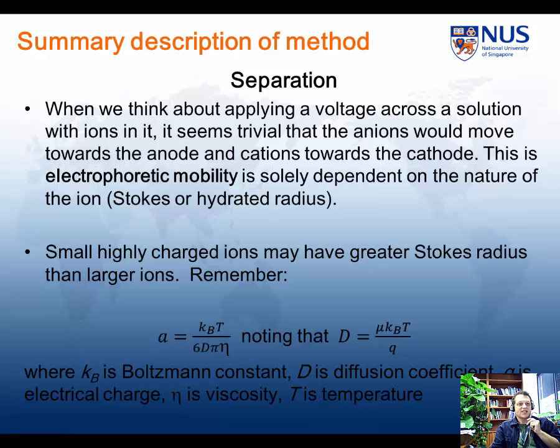This is usually expressed as a Stokes radius, and on the screen you can see the definitions of that. I won't go on and define the terms, I think probably you've met them before. So that's the one we're interested in, electrophoretic mobility. It's really the basis of the method.